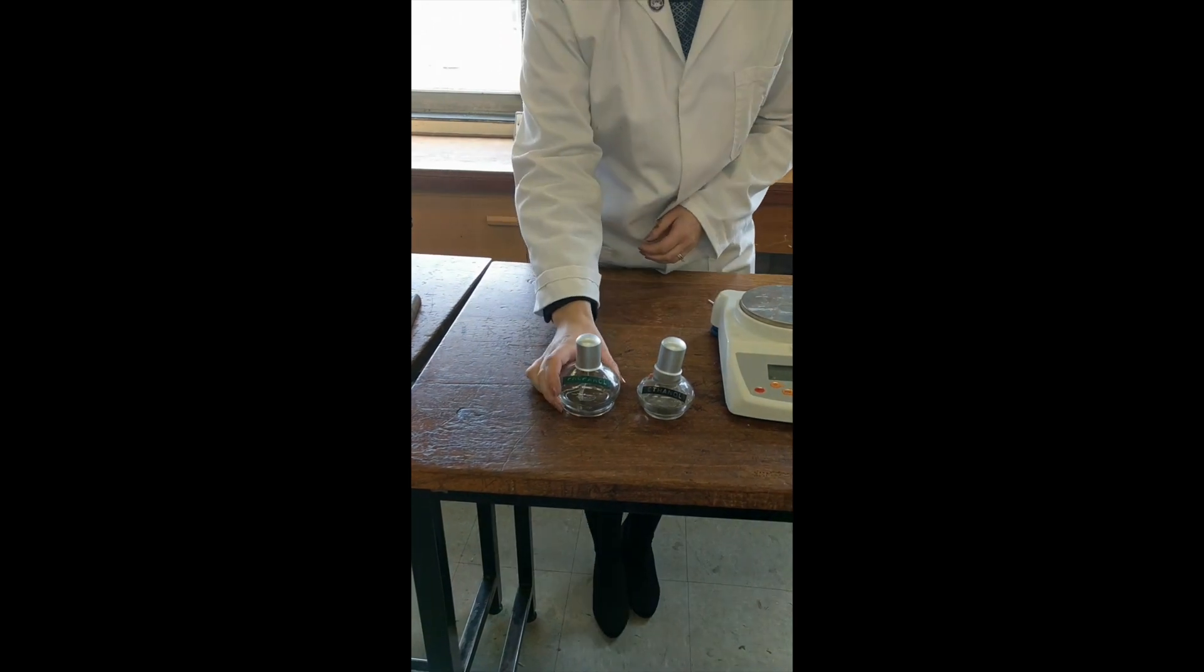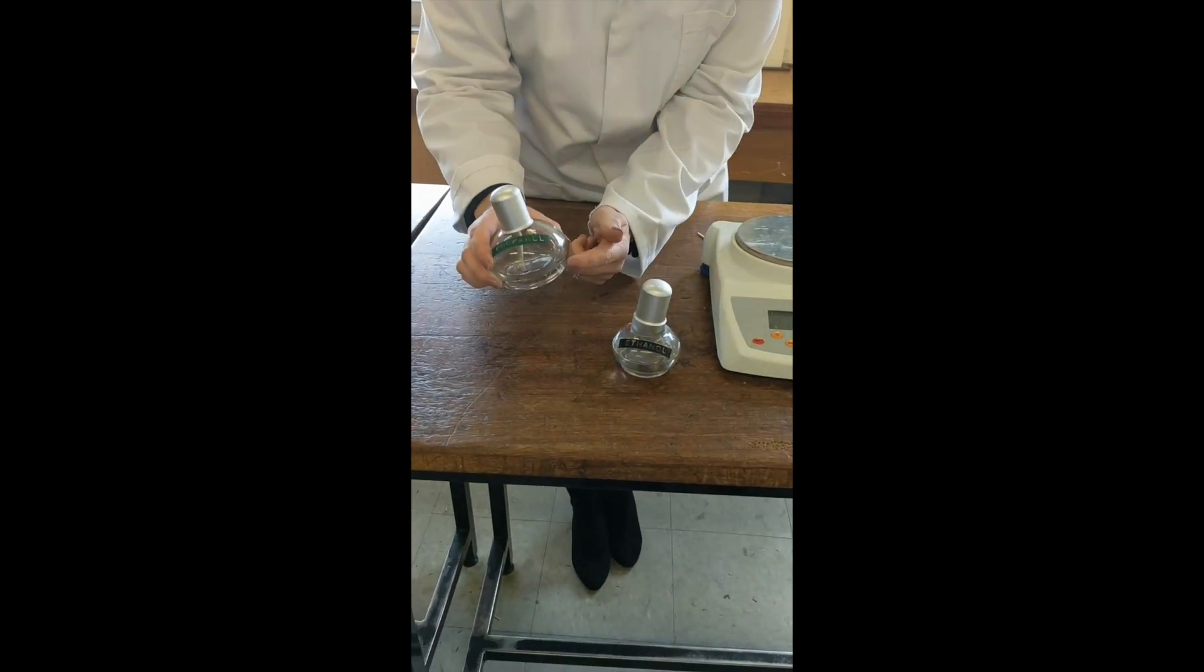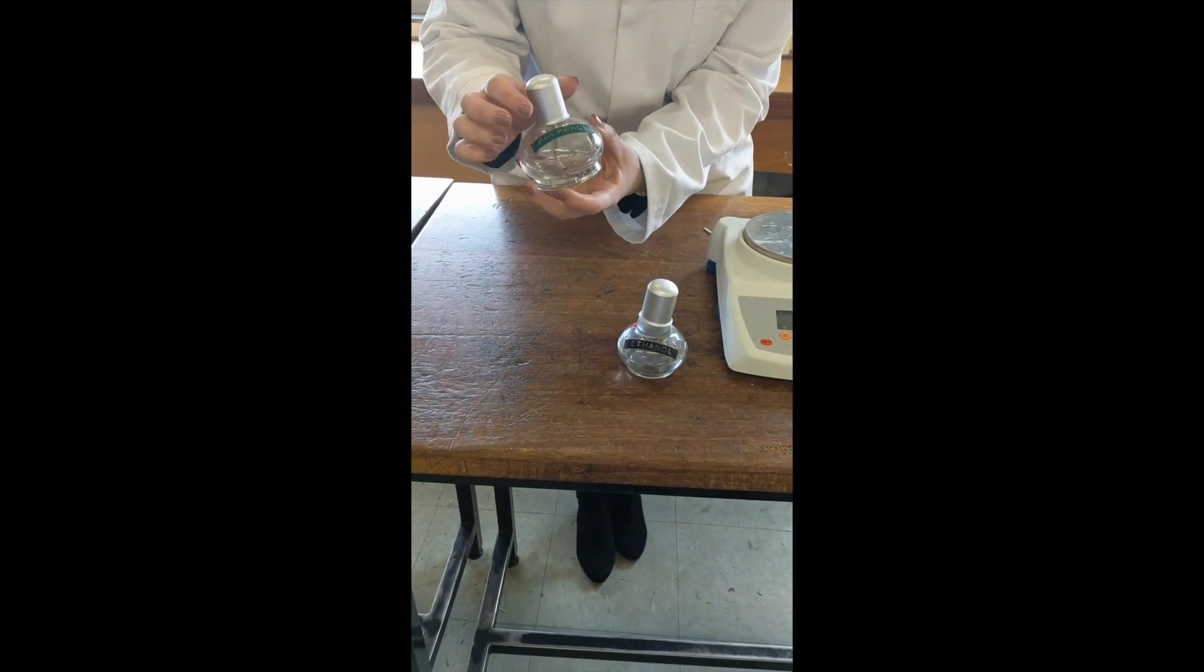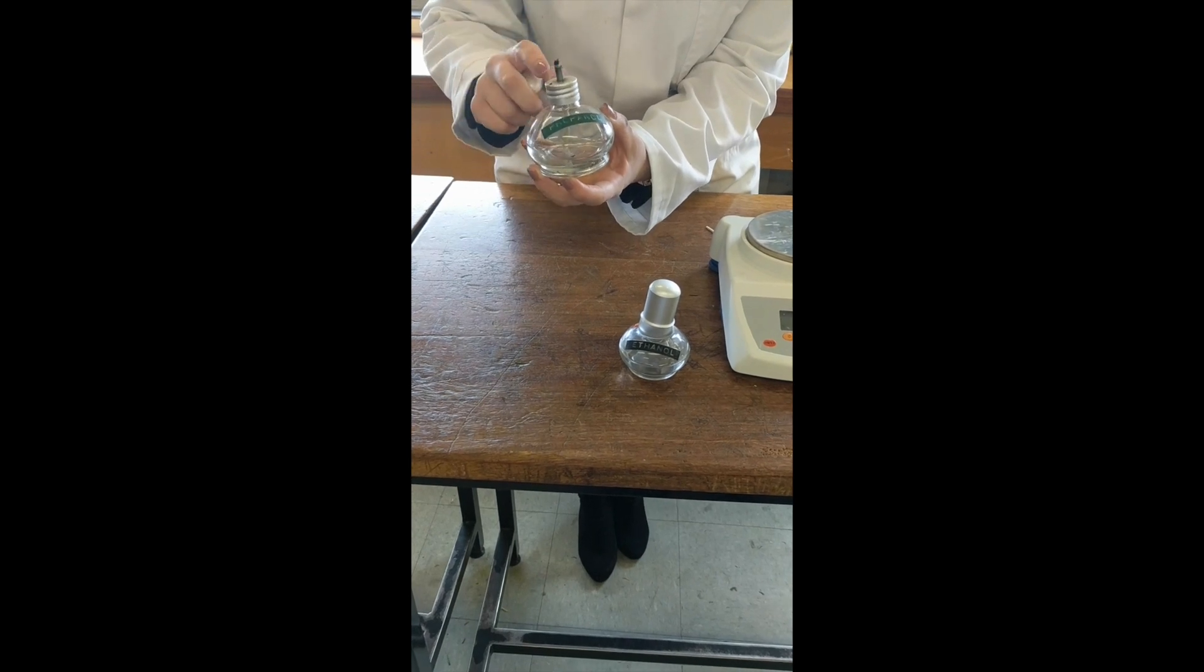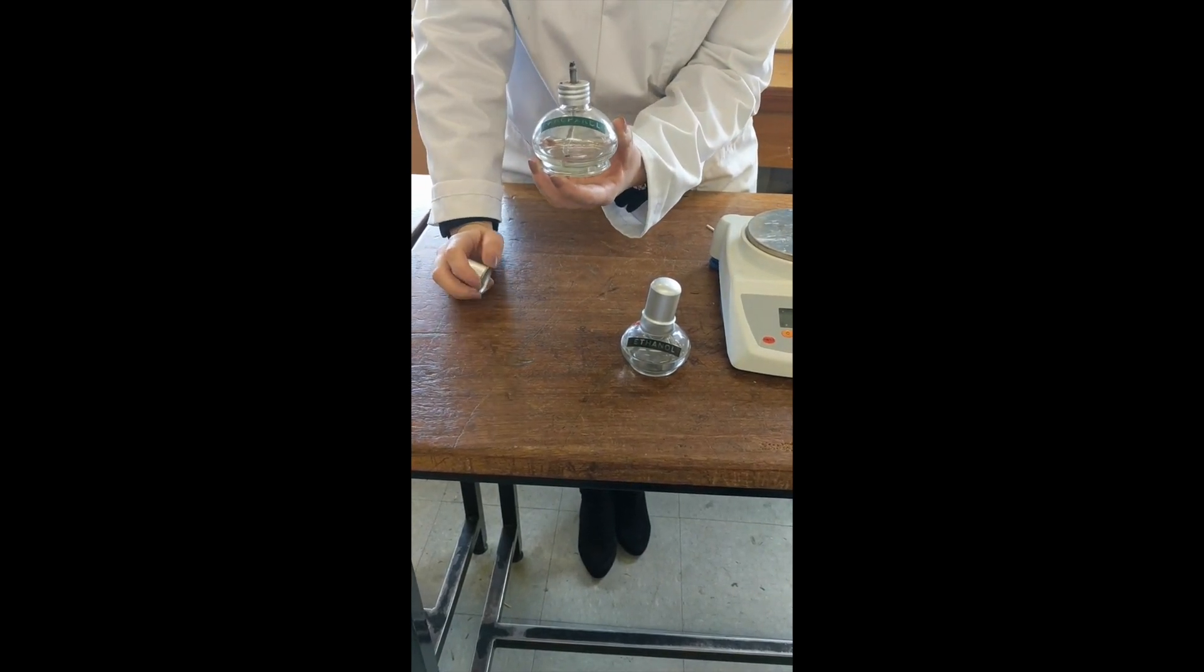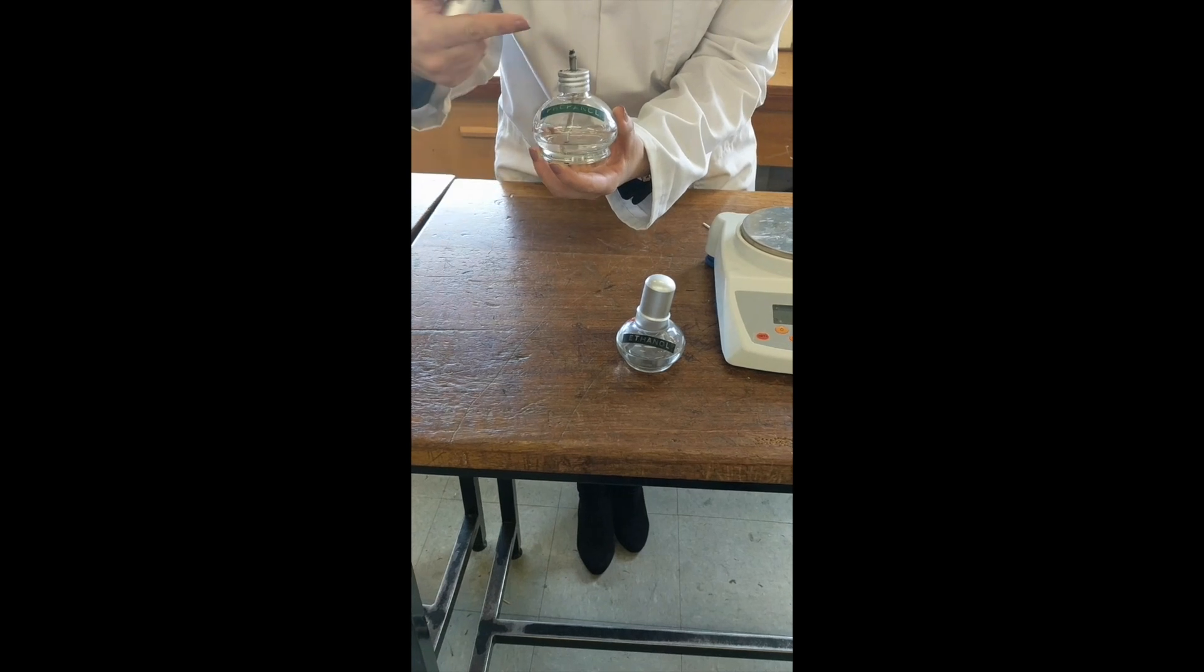The fuels are sealed in a spirit burner. So the fuel is stored at the bottom. A wick is soaked in it. And what we would do is we would set a light to the wick at the top and that would burn the fuel and use up the fuel.